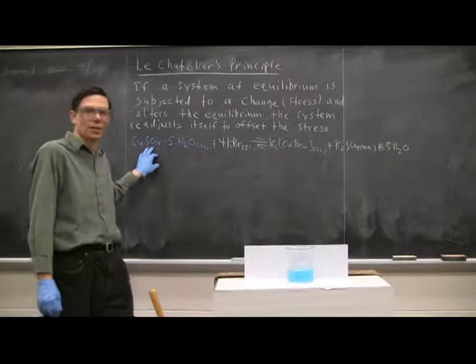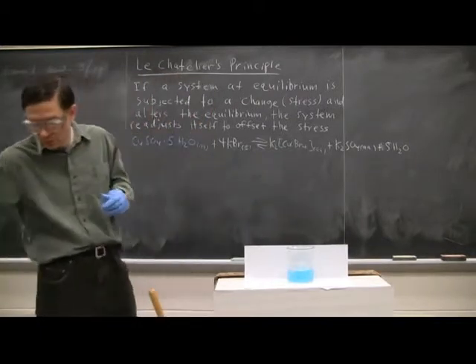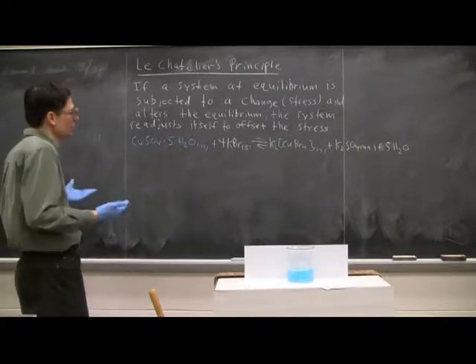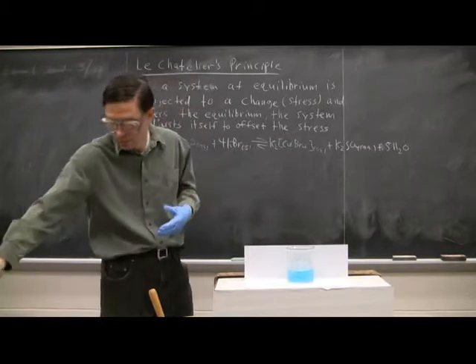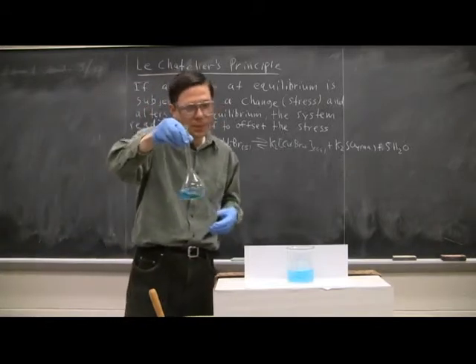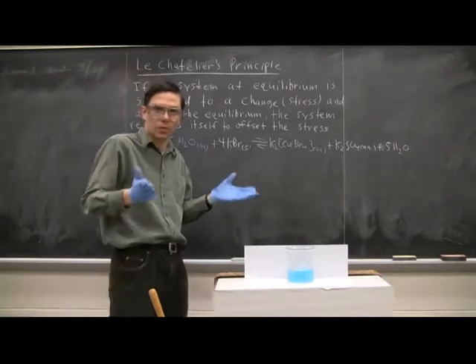We have copper sulfate pentahydrate. This is a very small amount, 5 grams in a 250 milliliter volumetric flask. That's what originally was here. And we see that we have a blue colored solution, a very pretty blue color.